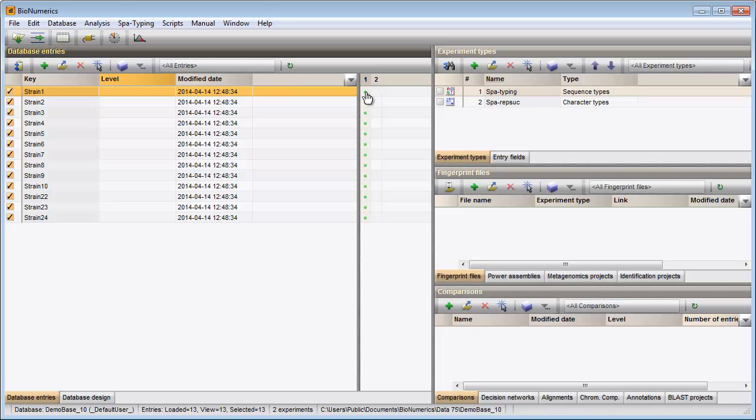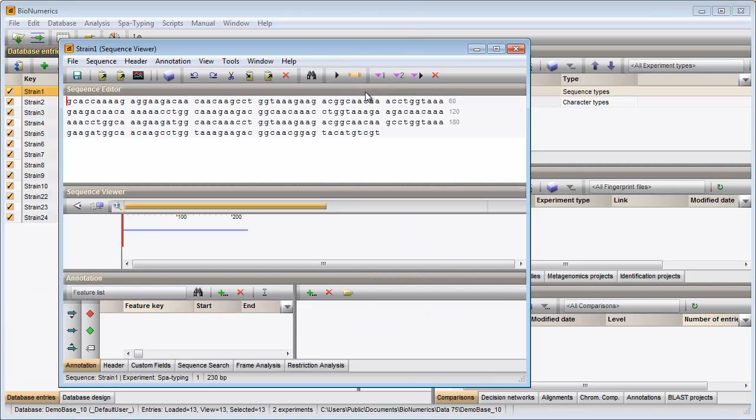To open the sequence editor, I can just click on the colored dot. The assembly window is called with this button.